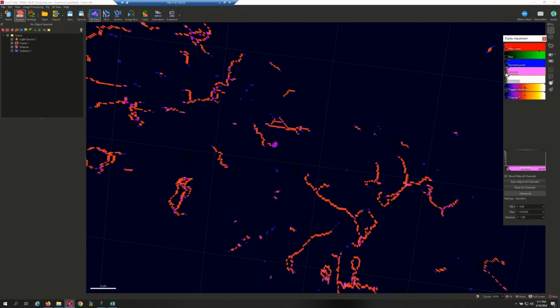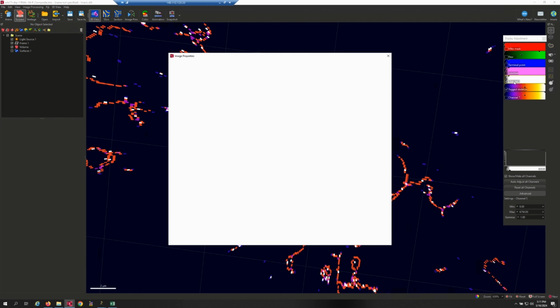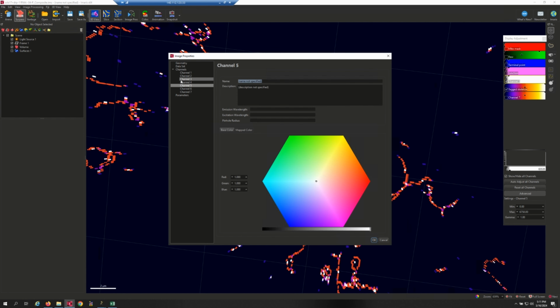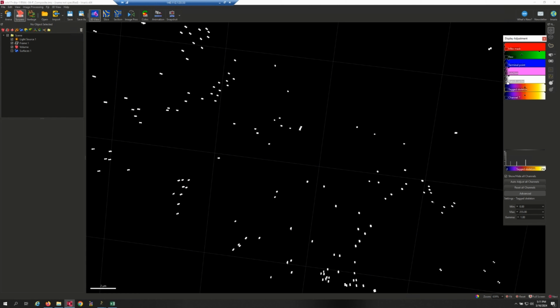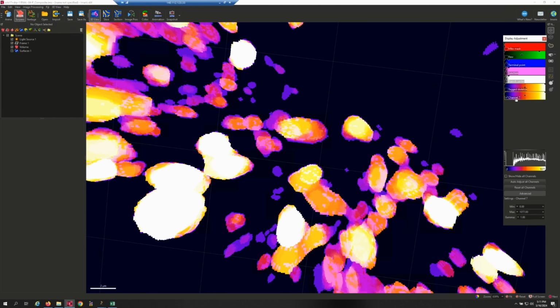What is the 5th channel? The 5th channel is actually the position of the center point of each branch. In this mask, the center point location of its branch. How many did we end up counting? Then find out how many branches it actually has. So this is branch center. Okay. Then what is channel 7? Channel 7 is thickness.